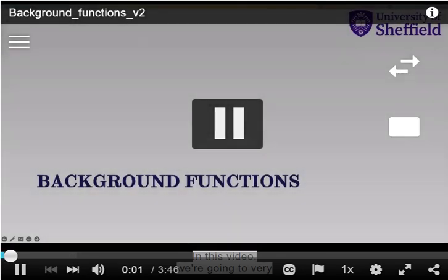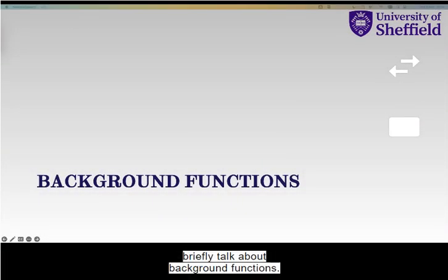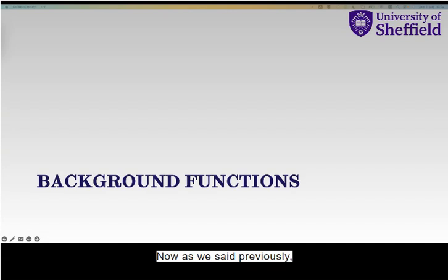So in this video, we're going to very briefly talk about background functions. Now, as we said previously, we can think of our diffraction pattern as a series of peaks sitting on this background function. And therefore, the quality of our fit, and getting a good quality fit, is going to require us to have a good fit to the background with some sort of background function.